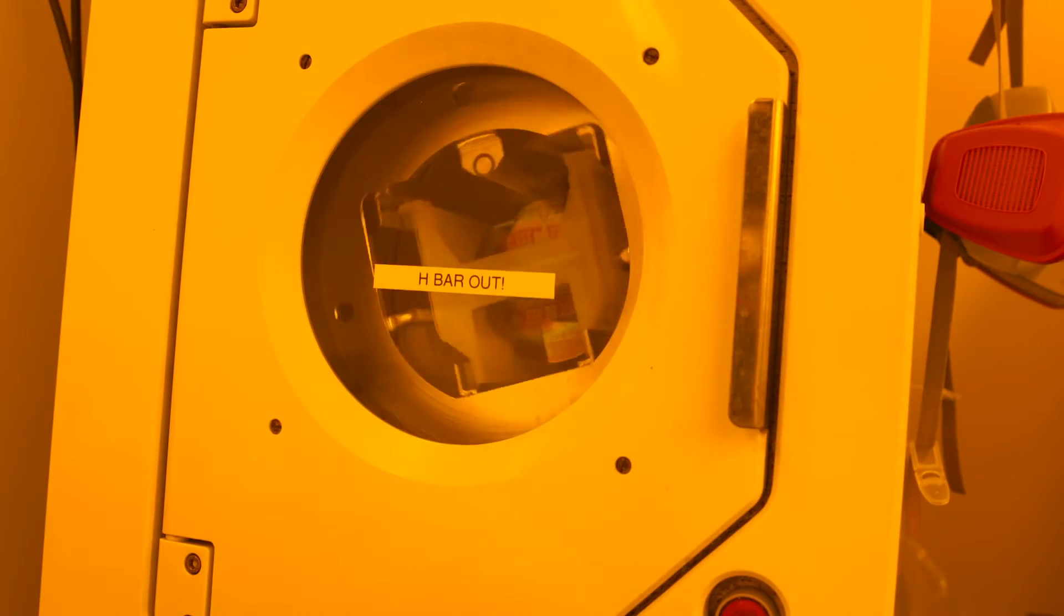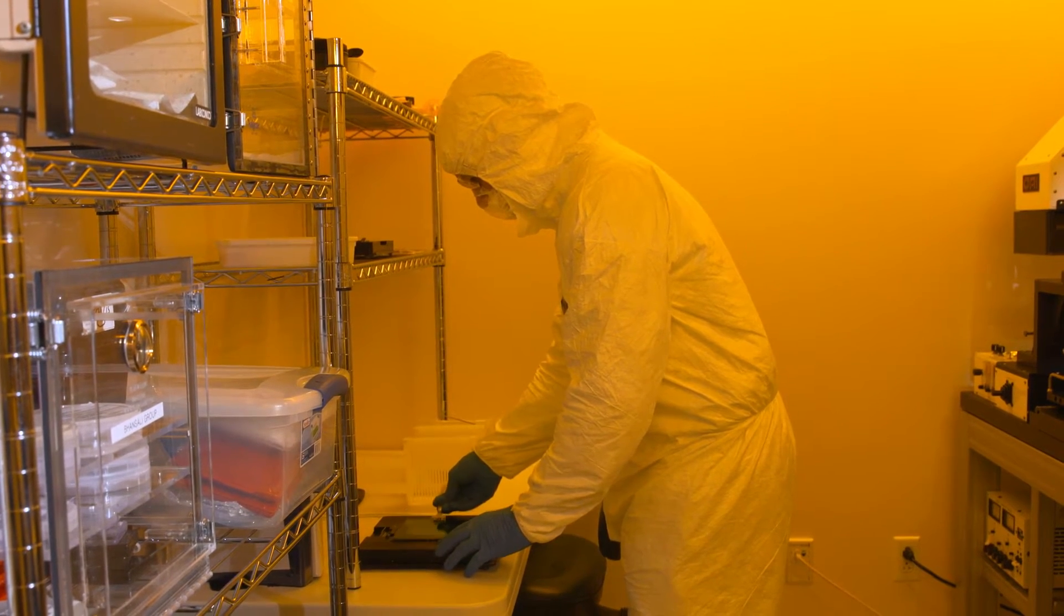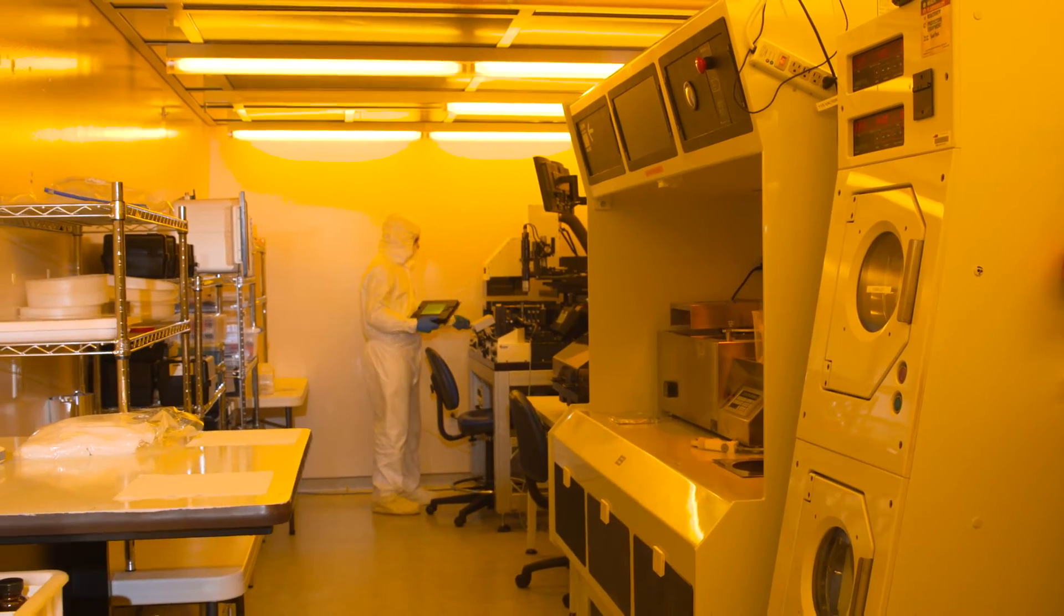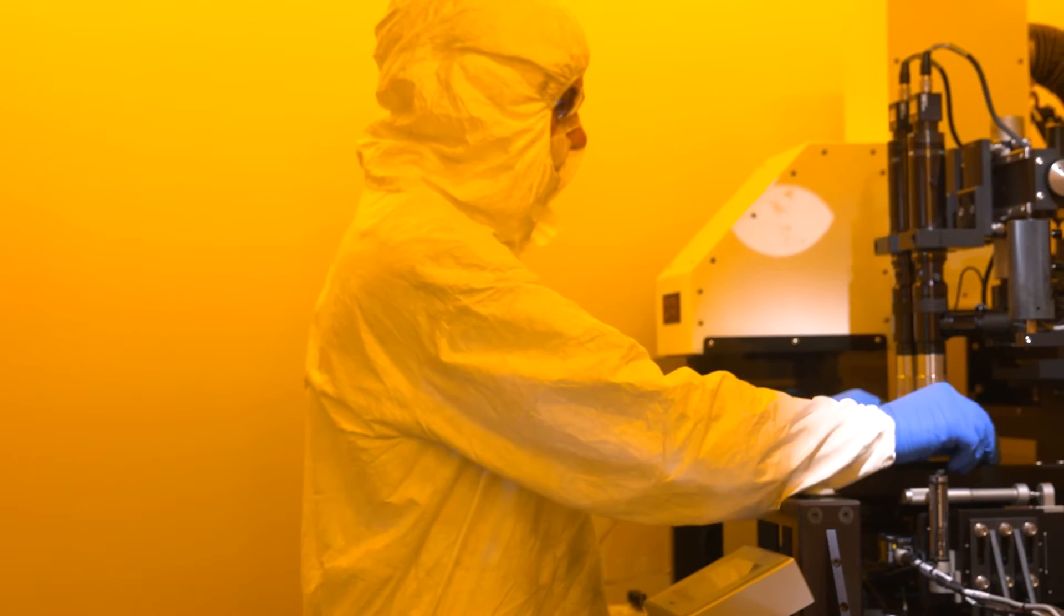The processing of thin films and coatings using PE-CVD, ALD, CVD and evaporation is also possible. The interior clean room offers a full suite of photolithography tools.